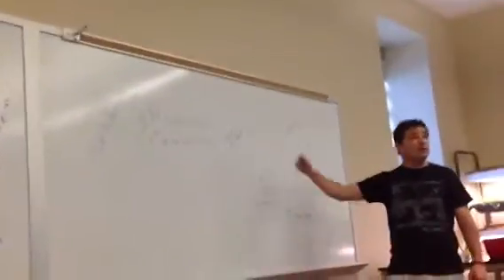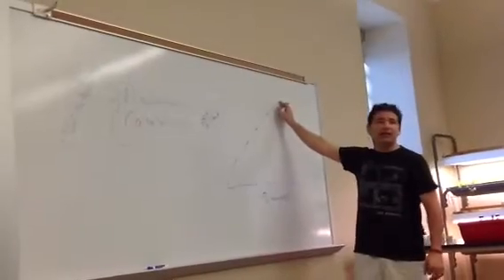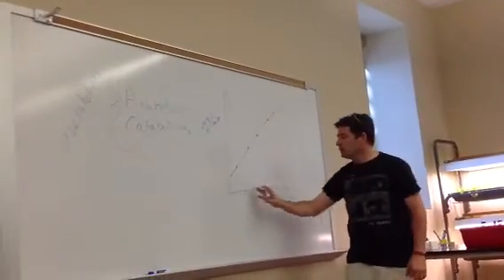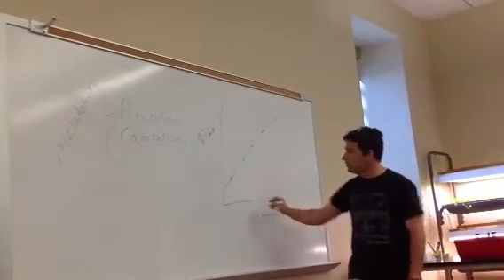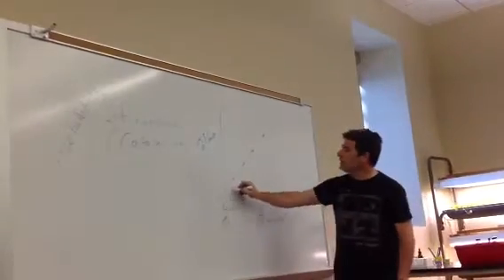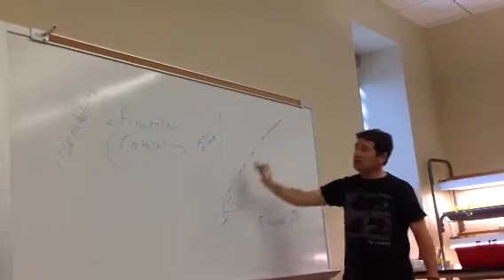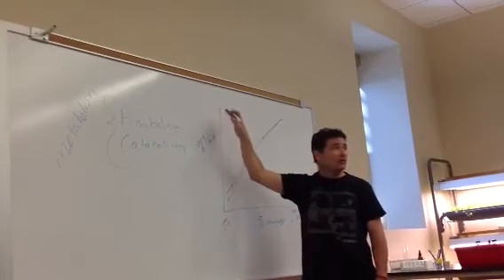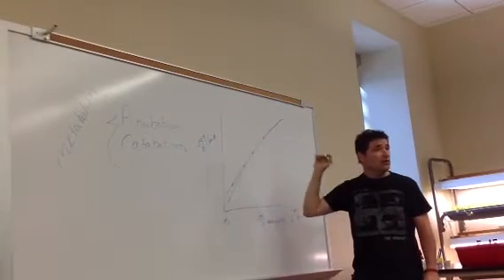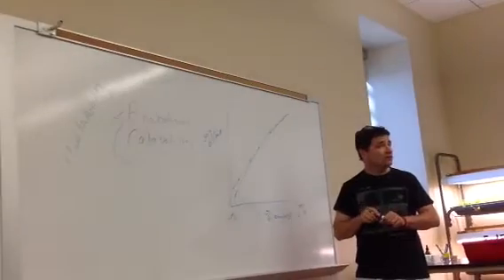But you should have ended up with this relationship where our reaction rate increases with increasing amylase concentration. Right? 0% amylase, 2%. We should have seen something like this. More concentrated amylase ends up with a higher reaction rate. Right? So hopefully you saw a relationship something like that in figure 2.